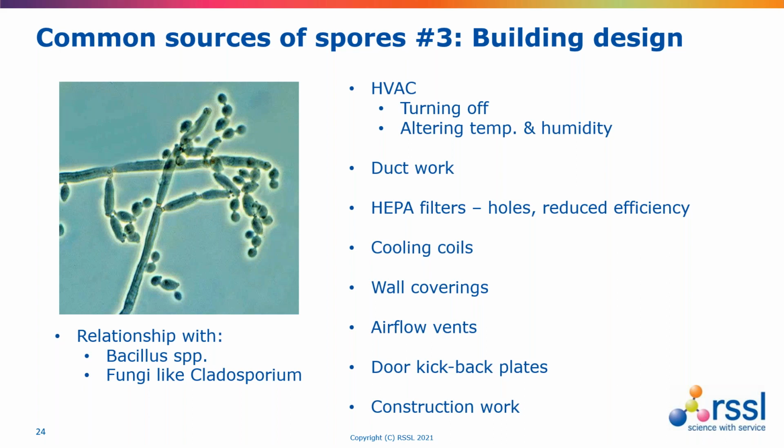You need to be mindful that there's a big push at the moment towards energy saving, which leads to things like reducing airflow rates, but that's never done to the degree that could be a source of contamination. You also need to be careful not to make uncontrolled adjustments to temperature and humidity, because they might create conditions that are more favourable for contamination, and make sure that's all covered through change control.